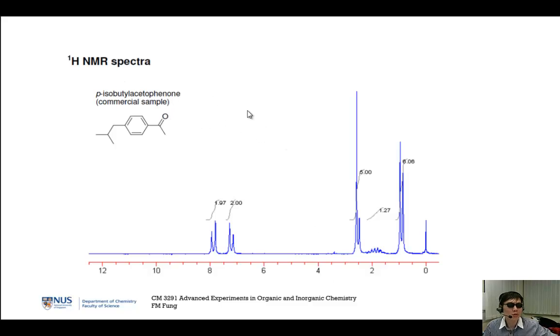I'm going to give you the very nice proton NMR spectrum of the starting material and all the rest of the intermediates. Because in the end, you're going to do a 2D NMR as a team. I don't want you to see such a complex 2D NMR and then go "chua", and after that some people just give up and say "swala". Is that how they say it?